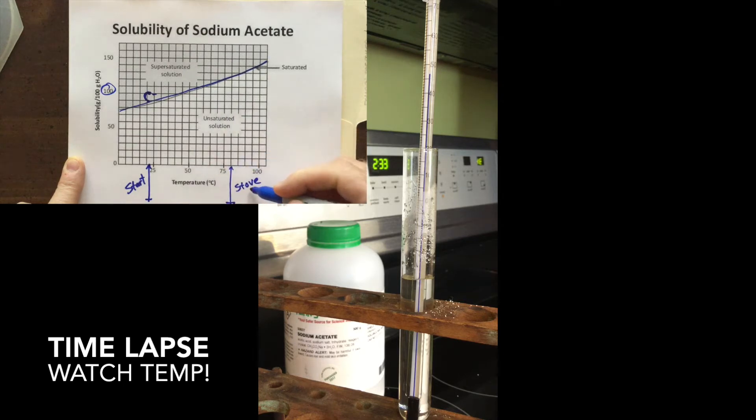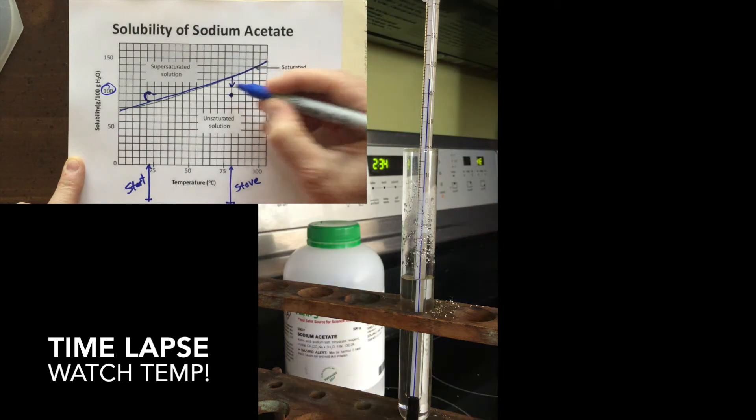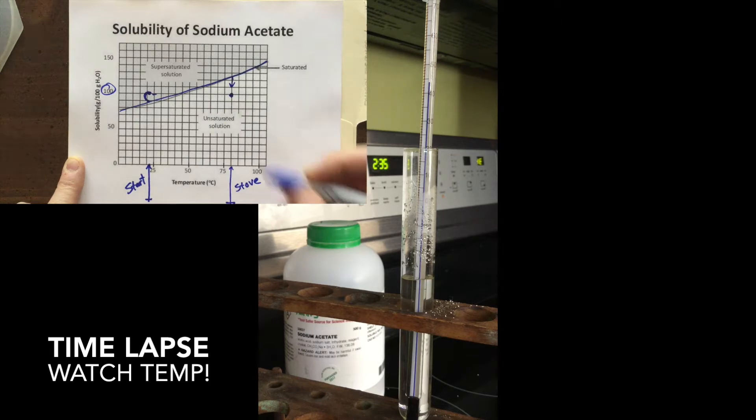And so when we turned it up on the stove to 80 degrees, we were right here. We were actually underneath this line. And when you're underneath the line, you're actually unsaturated. It could hold more salt. Then as it was above or beneath that line, we let it cool down. And that's what you're watching right now.